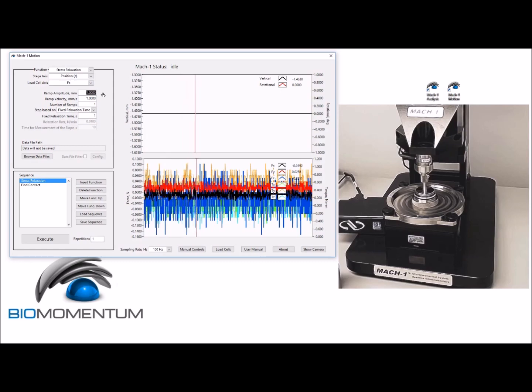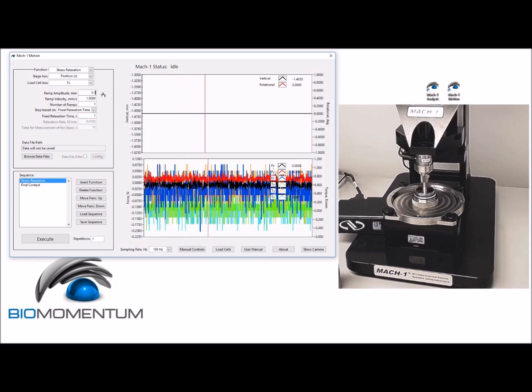And a ramp velocity of 0.4 percent of the sample thickness per second, which corresponds to 0.005852 millimeter per second.